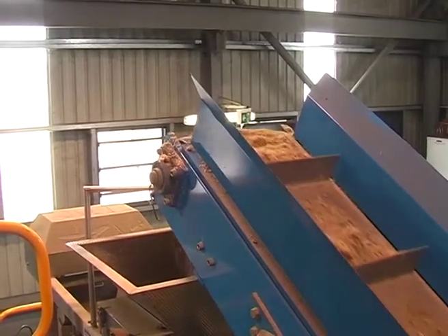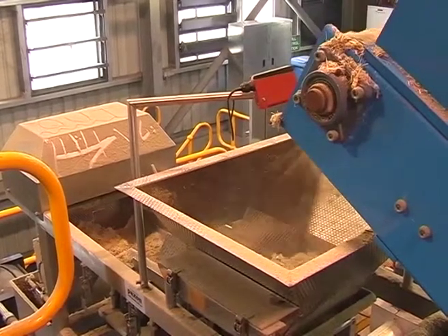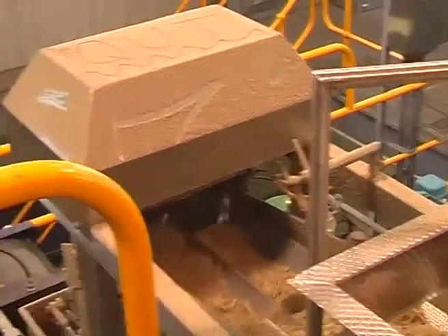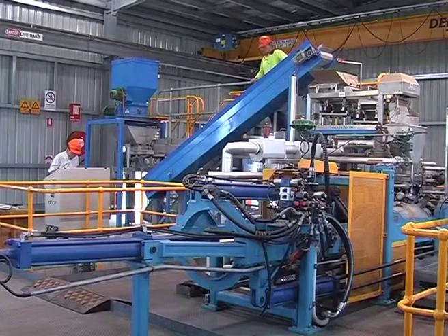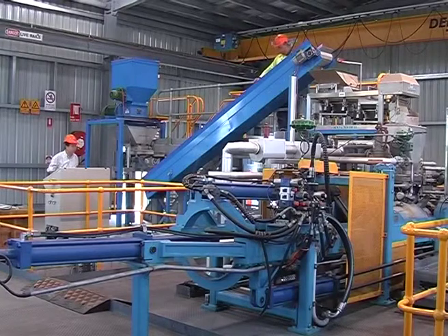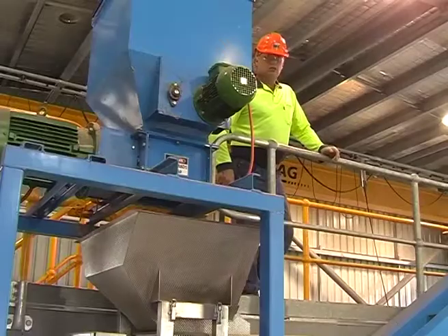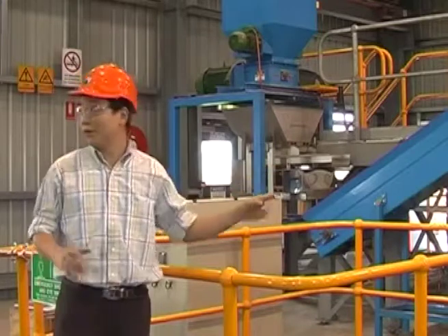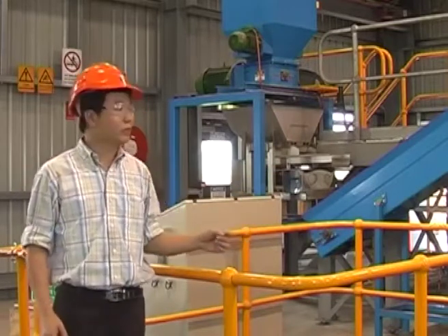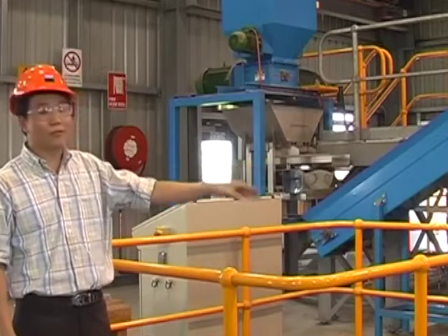In this reactor, we add steam and chemicals for the reaction to take place. The process is called pre-treatment. The purpose is to make the biomass easy to break down during the hydrolysis process. We add steam and chemicals, and sometimes we have water to wash it before the other process.